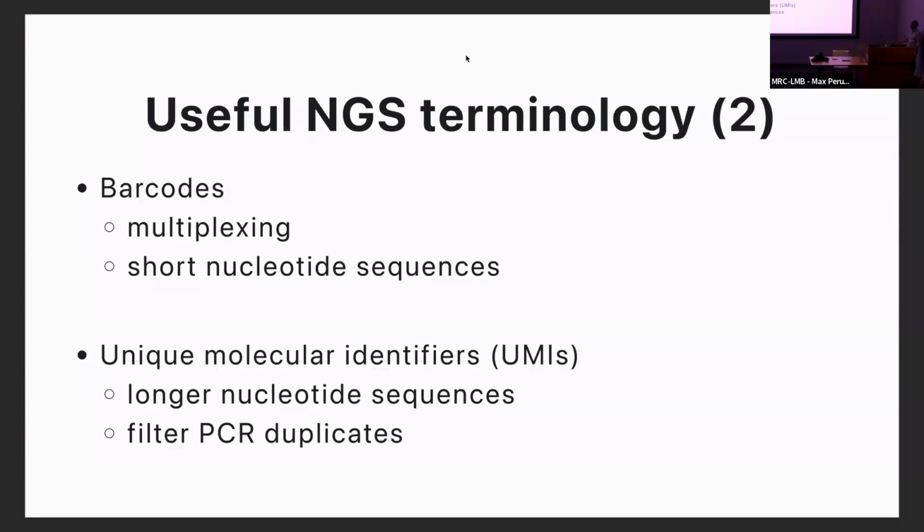So by looking at the unique molecular identifiers, which are barcode sequences, about, I don't know, 26 base pairs in one example, and they're random sequences, you wouldn't expect the same molecule by chance to have the same UMI. If a molecule has the same UMI, you can be sure it's a PCR duplicate and remove it. Okay, so that's the idea.